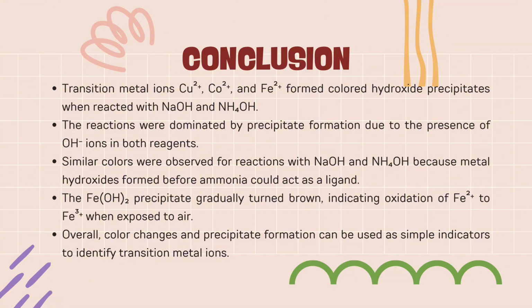Overall, the experiment demonstrates that transition metal ions form characteristic hydroxide precipitates when reacting with basic ligands. The similarities between the sodium hydroxide and ammonium hydroxide reactions show that hydroxide ions dominate the initial coordination, while the color change and oxidation behavior confirm the key properties of transition metals related to d orbitals and variable oxidation states.